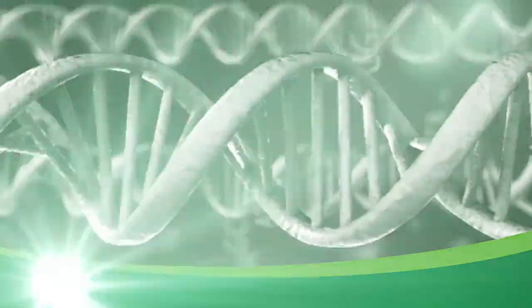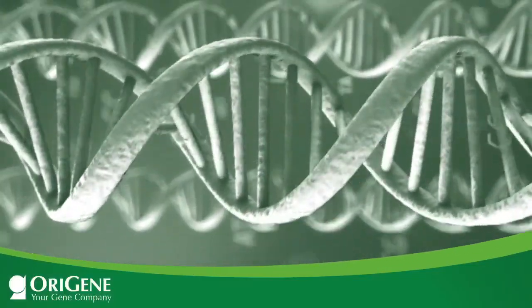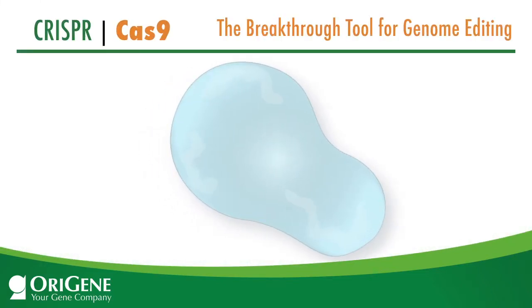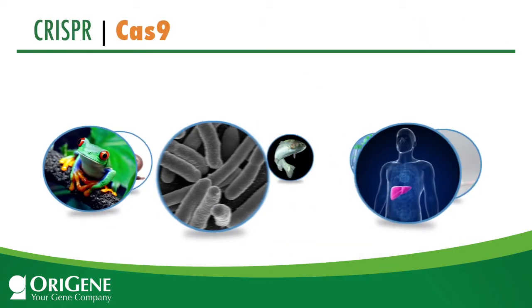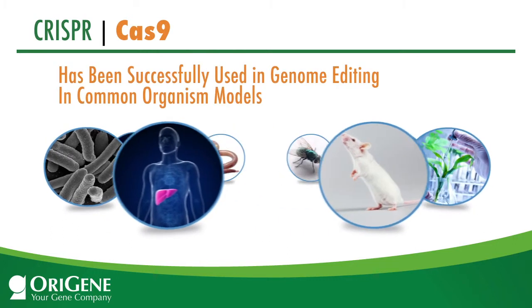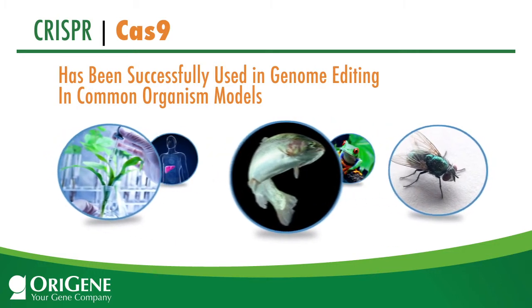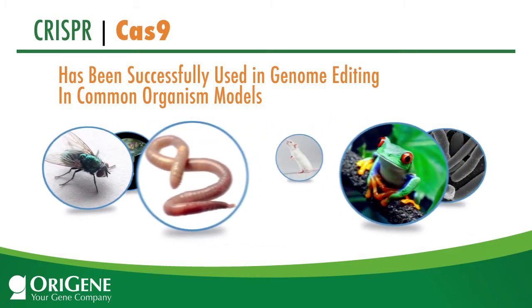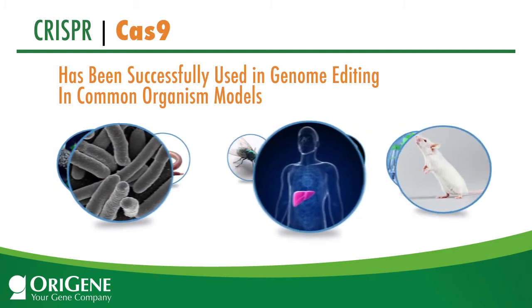Targeted genome modification has been hampered by the lack of an efficient tool to create a double-stranded break at a designed location. The CRISPR-Cas system is an RNA-guided nuclease system for targeted introduction of double-stranded DNA cleavage. Originally discovered in bacteria as an acquired defense against foreign pathogens, CRISPR-Cas technology has been demonstrated to work successfully in all the common model organisms, making it one of the hottest technology breakthroughs in 2013.